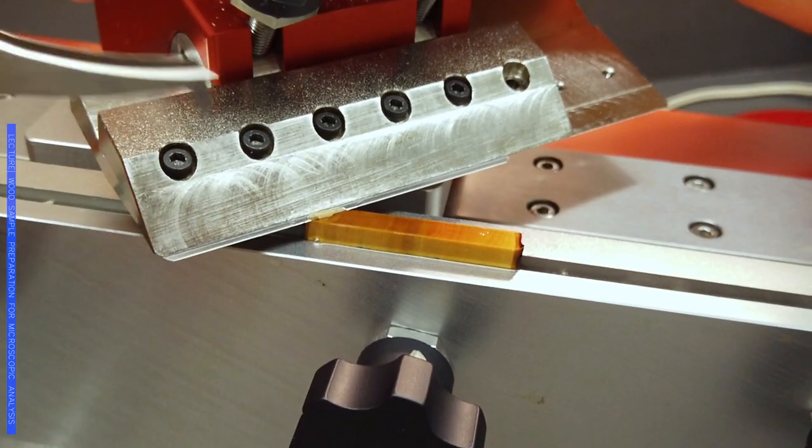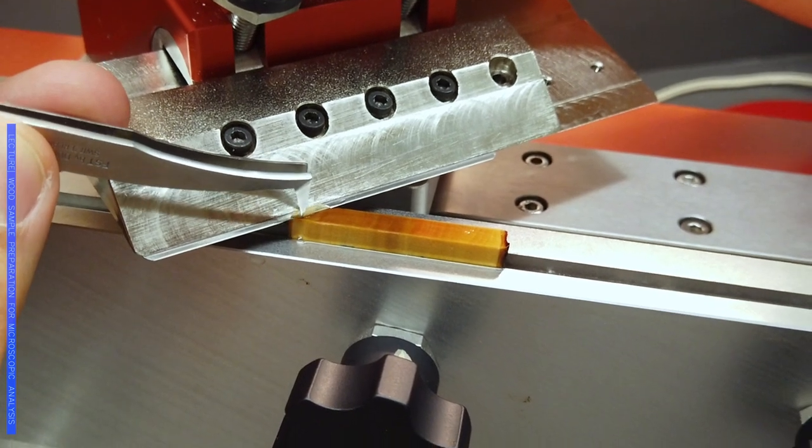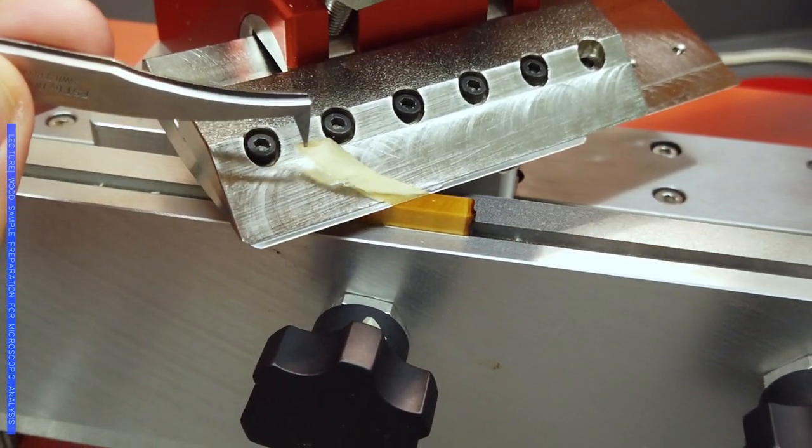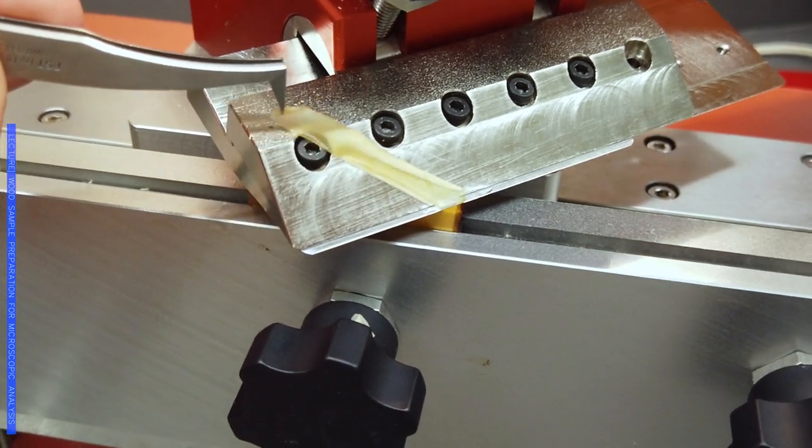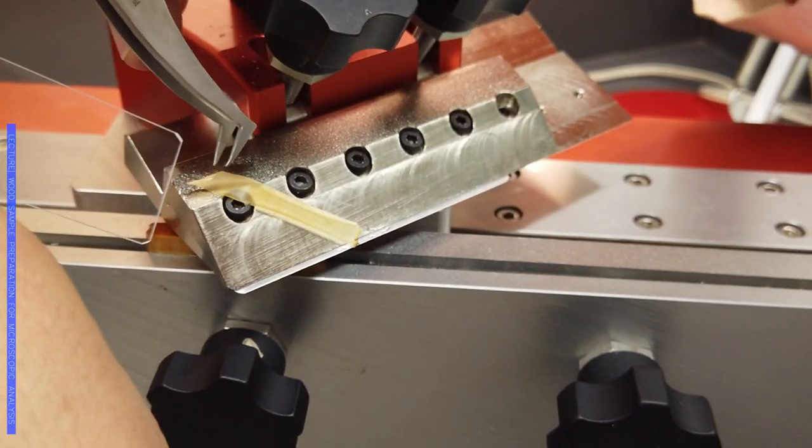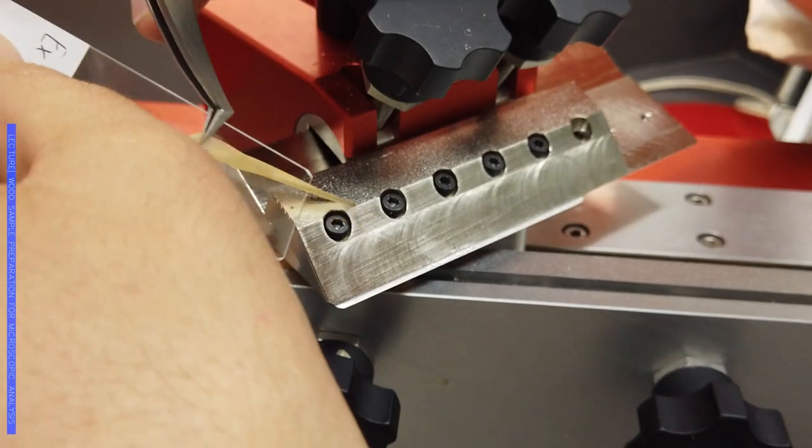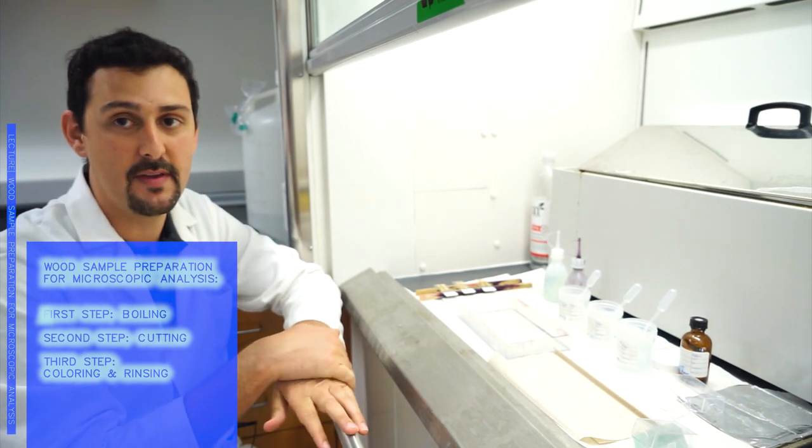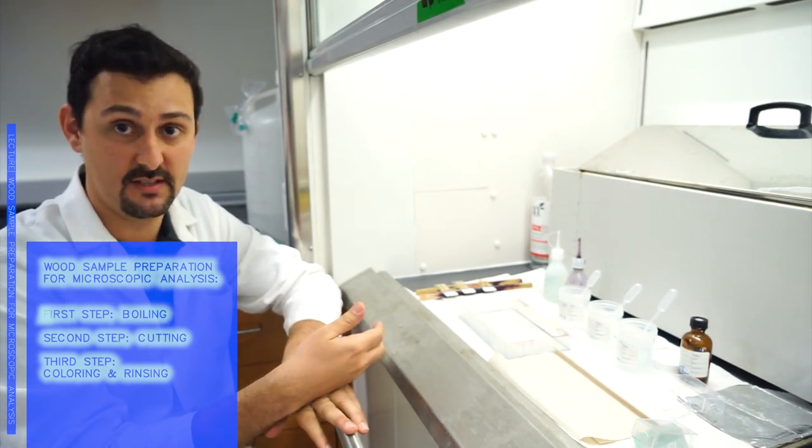Okay, I think we are there to make some nice cuts. Now after we have got our cuts from the microtome, we have to move to the hood because we are starting the coloring process of our samples.